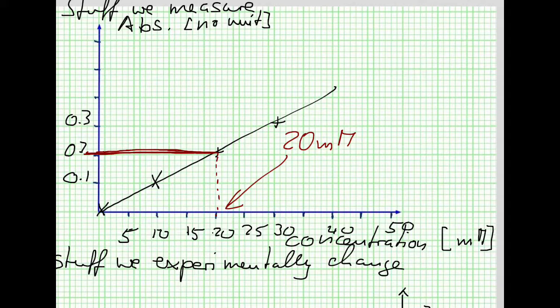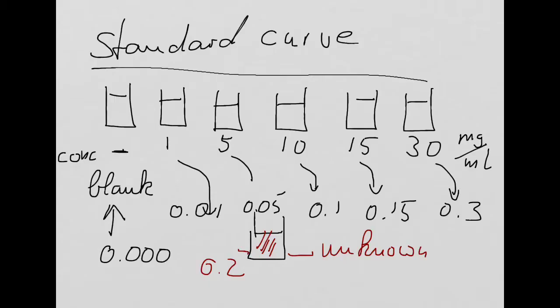So that is basically what you have to do tomorrow in your assessed practicals. You make a standard curve, you measure your unknown concentration, the absorbance, and you try to read from your standard curve what the concentration is. So far, so good. Does that make sense? Yeah. Pretty simple and straightforward. At a concentration of 0, we blank. So, concentration of 0 should give us 0.